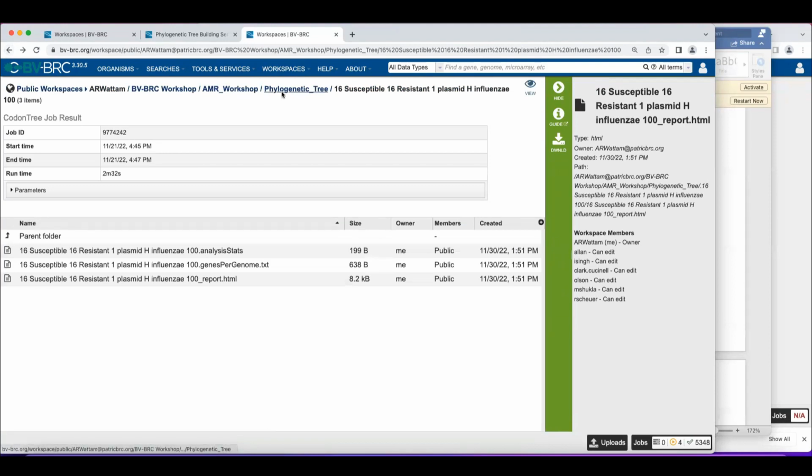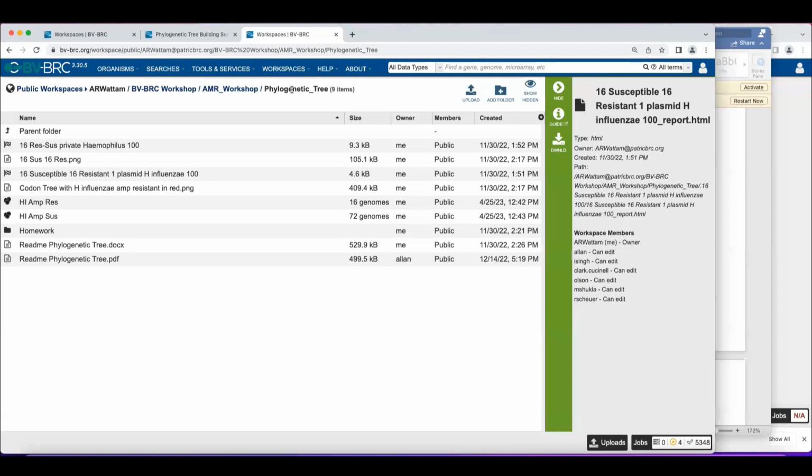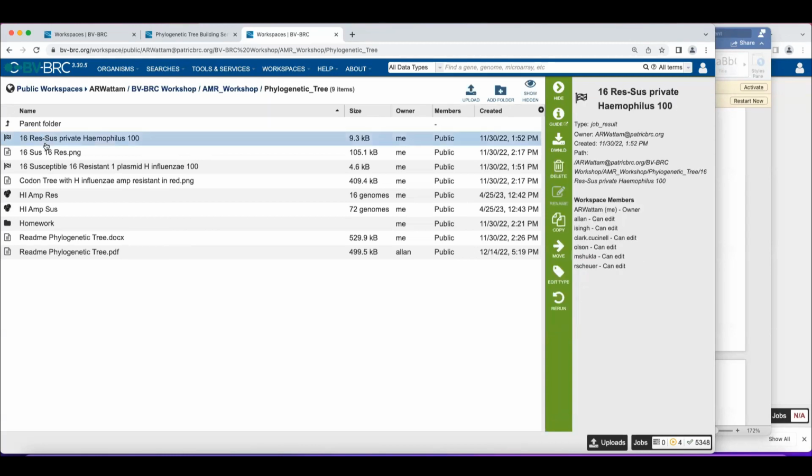So here's a question to the group as a whole. What's wrong with plasmid genomes? Could we make a tree with plasmid genomes? What's so special about them? Why are they not good for these types of analyses? It's because they're small and the genes on them are generally not broadly shared. They're very unusual, so when you compare them against a lot of other bacterial genomes, often they don't share genes. So there's not going to be any way to have enough to generate a tree unless you do things beforehand to see how many genes are shared across those. It can be done if you're clever, but just going there from the very beginning, you'll have problems.